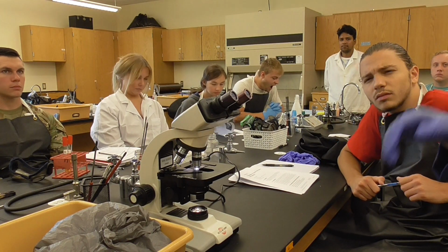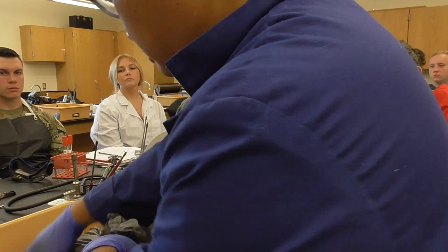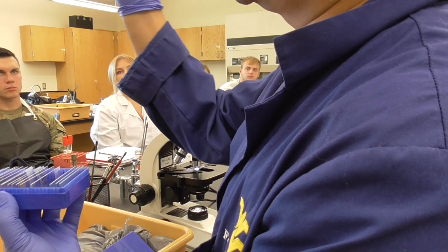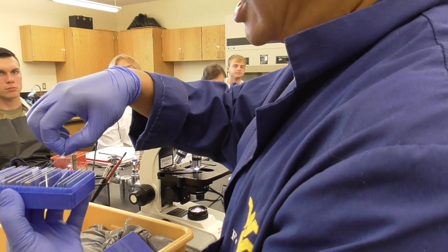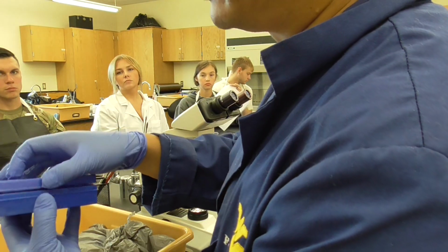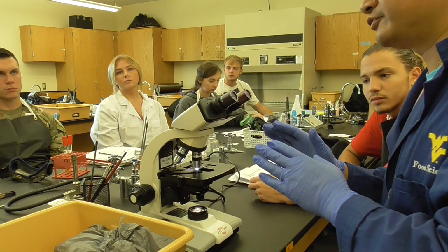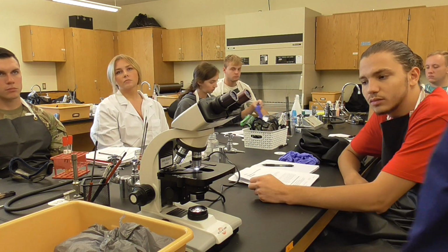So everybody, if you find your box, any of these pieces is still good, make sure you clean it, use these. I had some backup, but it's not gonna last for everybody the whole semester. So clean these first, clean your lens first, then go ahead to do the simple stuff. Okay, very good.